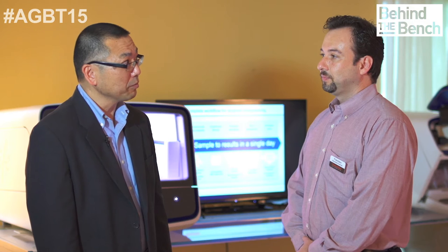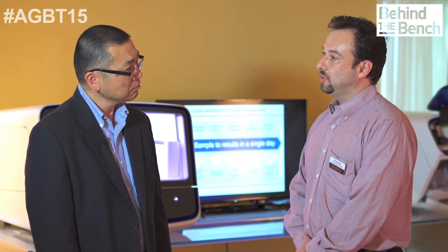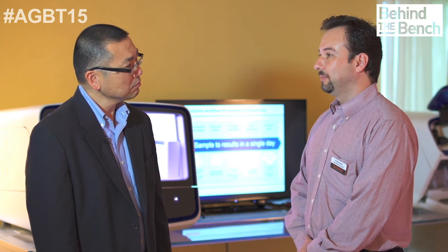One is the introduction of 140 base pair solutions that we are able to provide to the users. It's very easy to do. You select the amplicon size that you want, then you do the calculation and that solution is shown to you as part of the results page. And 140 bases refers to? 140 bases.